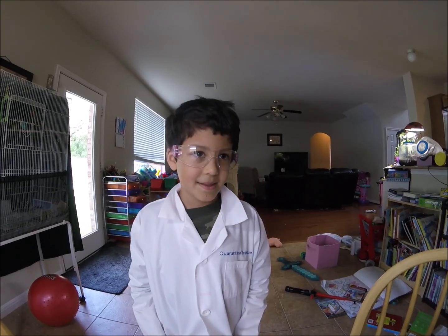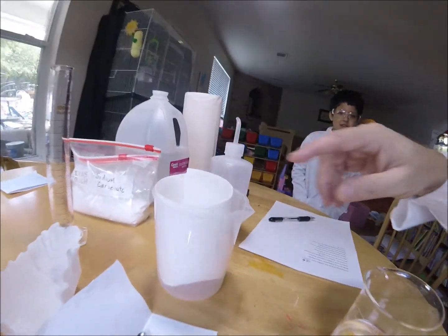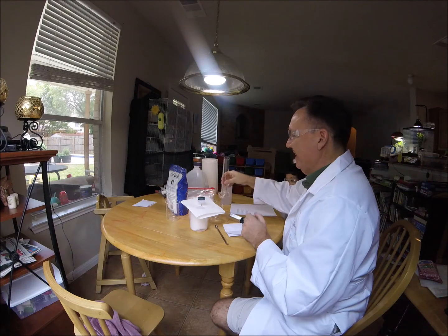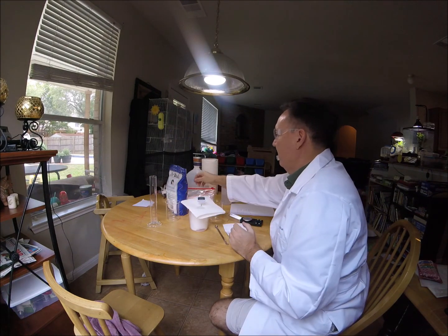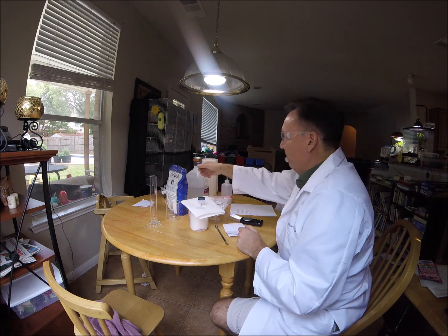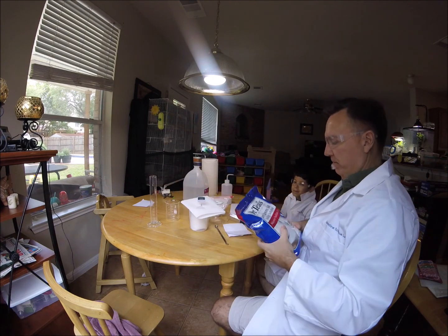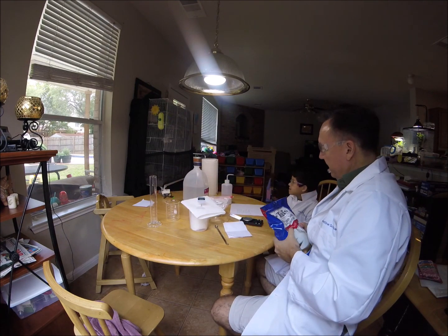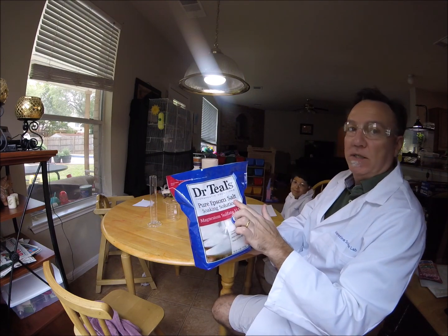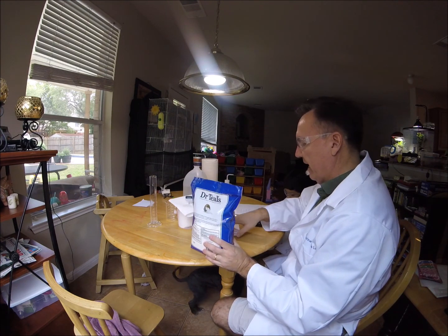We're going to measure any temperature change from the reaction in a calorimeter. First let's weigh out our reagents. So first weigh out 5.7 grams of magnesium sulfate. Magnesium sulfate is called Epsom salt. It's a household product that most households have.